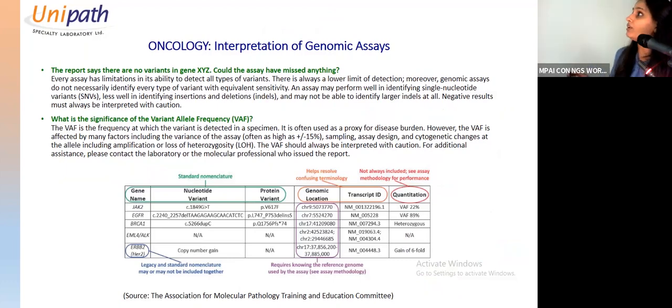So you need to question yourself and decide, right? However, that is affected by many factors including the design of the assay, sampling changes, and the computation process.